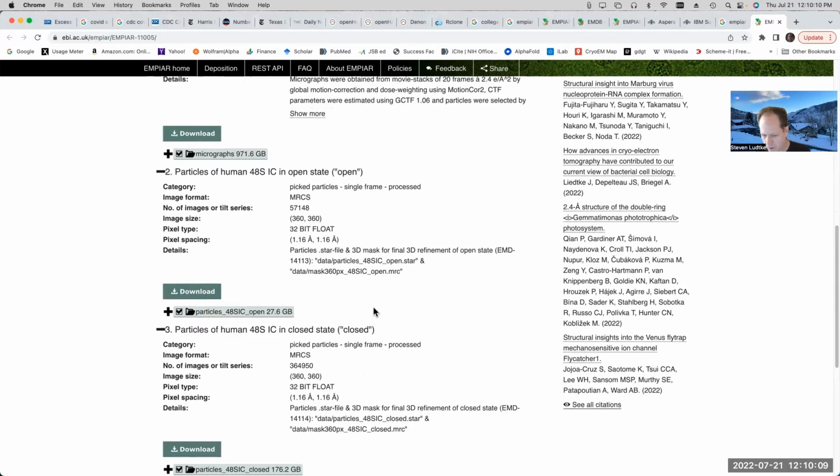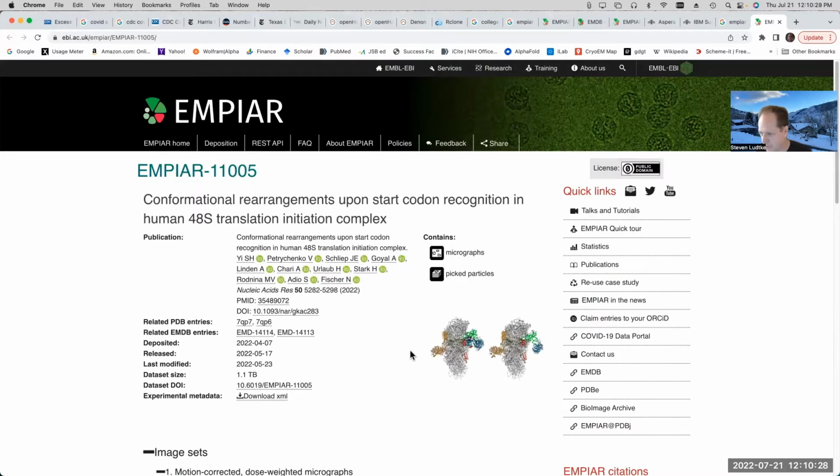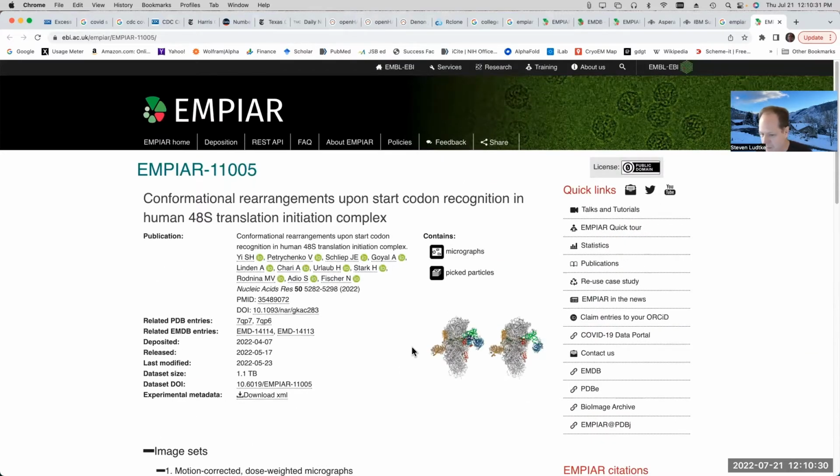And my thought was that we would mix these two data sets. I mean, they're significantly different in size. This is only 57,000, 364,000. But anyway, that we might mix these two data sets together and then try running the Gaussian mixture model stuff on it. Again, I've never done it on this data set before. It may not do anything very useful. I suspect it'll probably give us something at least.